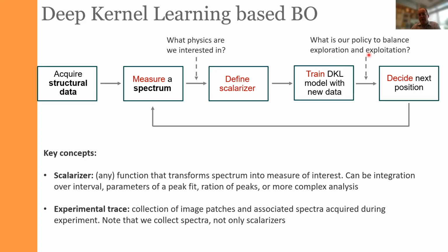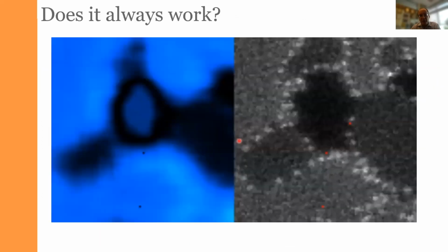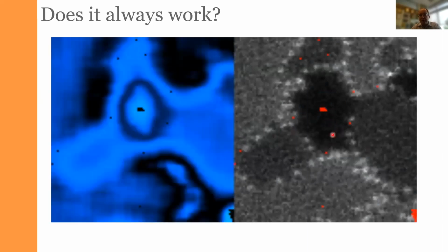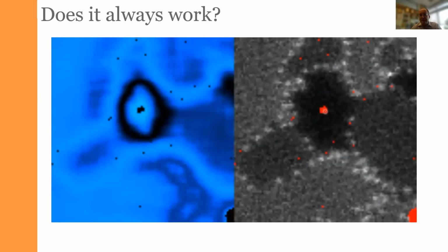And then you can ask, okay, we have these knobs, you have seen the codes that show how these parameters can be changed, but how do we know how to change them? This is the case where we need to come up with ways to monitor the progression of the automated experiment, and we need to make decisions based on how this experiment actually proceeds.